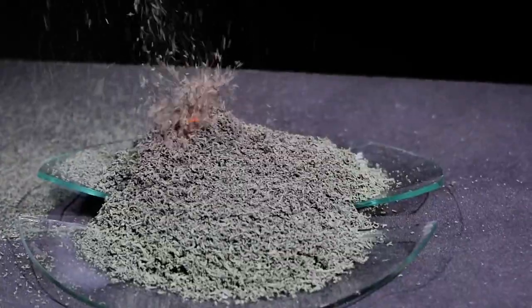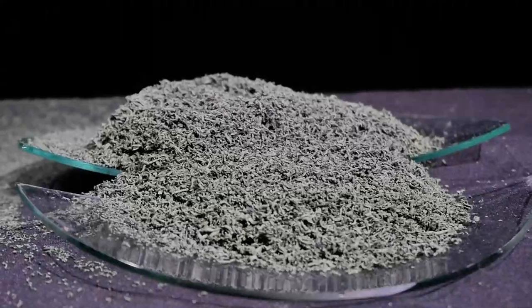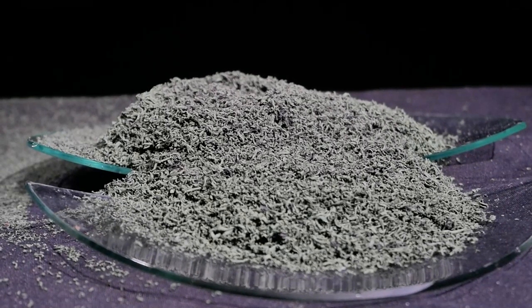Uh oh. Well, it looks like I got some cleanup to do. Did I mention it's exothermic? Yeah, I cracked my plate.